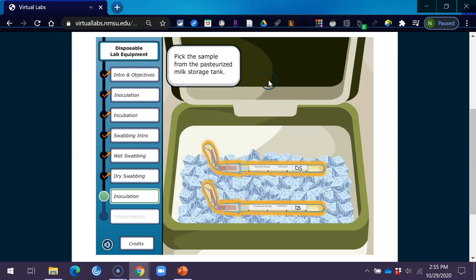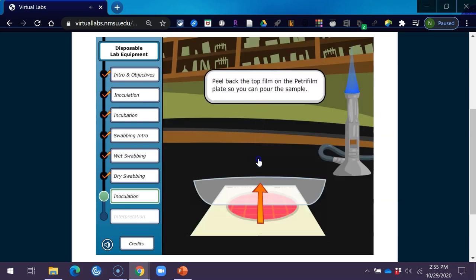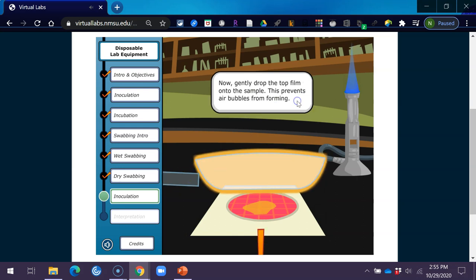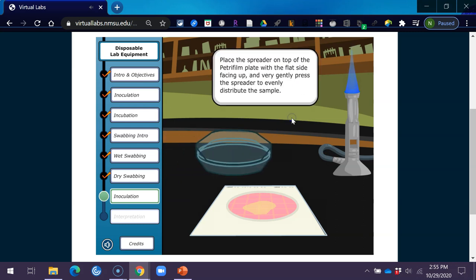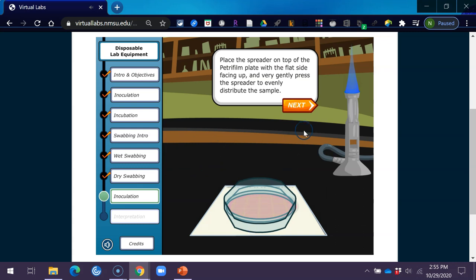Pick up the sample from the pasteurized milk storage tank. Peel back the top film on the Petri film plate so you can pour the sample. Now gently drop the top film onto the sample — this prevents air bubbles from forming. Place the spreader on top of the Petri film plate with the flat side facing up, and very gently press the spreader to evenly distribute the sample.